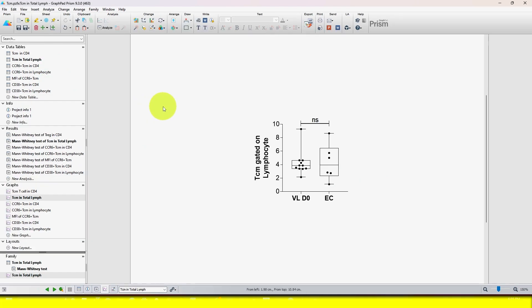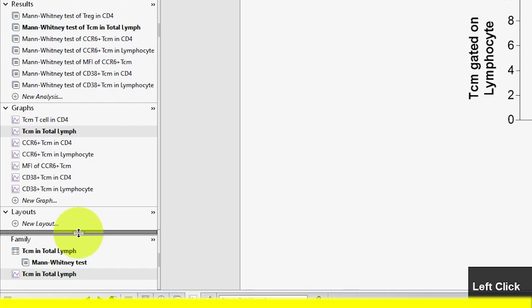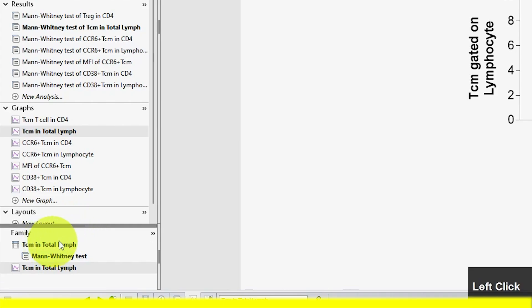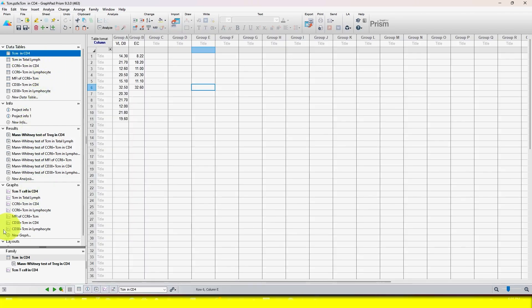To solve this problem, there are two ways you can do it very easily. The first method: you can see at the left bottom side, there is a Family option available in this Prism file. If you select any data file, you can see in the Family option that the three associated files — data, result, and graph — are highlighted separately.